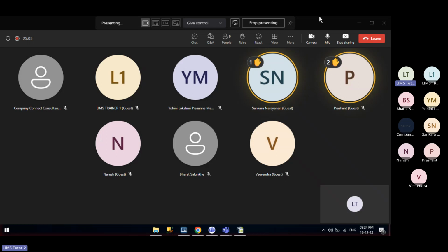There are some setups which need to be configured on the application server. There are setups which need to be installed on the web server. The database will always be installed on the DB server. And if the scheduler server is different, what kind of setup is required on the scheduler server? So whether I install on my PC or whether you install on the server, the steps are going to be the same.